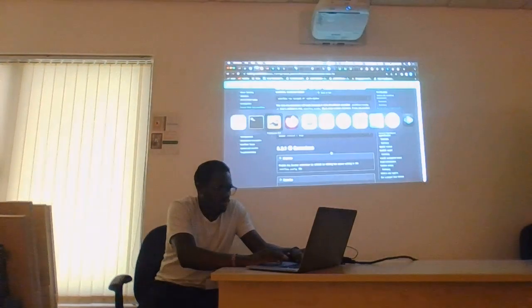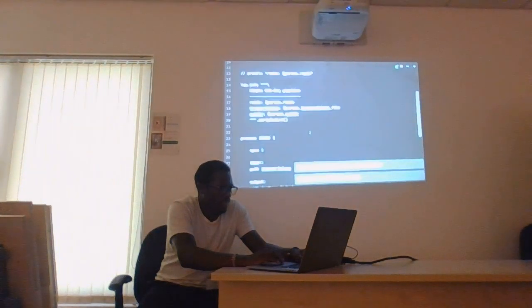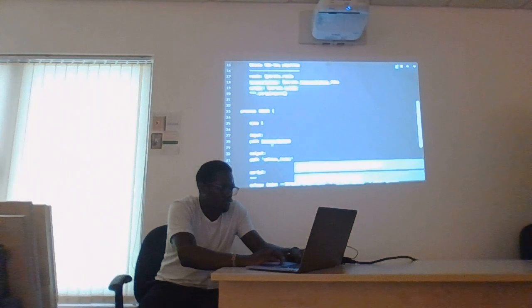Transcript, or let me see. Line 23. Transcript.